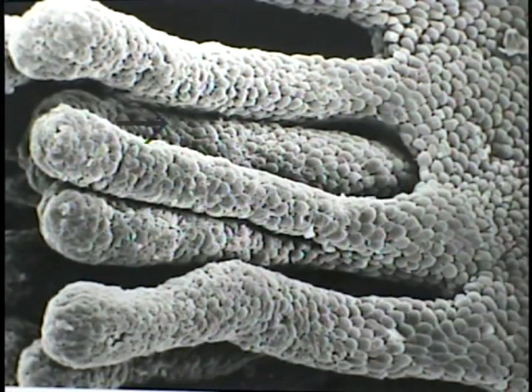This interesting scanning electron micrograph is courtesy of Professor Sato of Ashikawa University in Japan. What it is, is a digested specimen of the external surface of the crypts of Lieberkuhn, or the intestinal glands. So we're looking at the external surface of these simple tubular glands. The lamina propria and other tissue has been digested away.